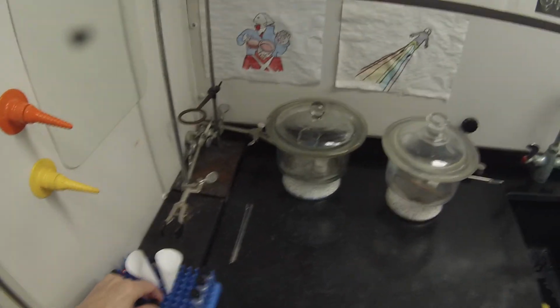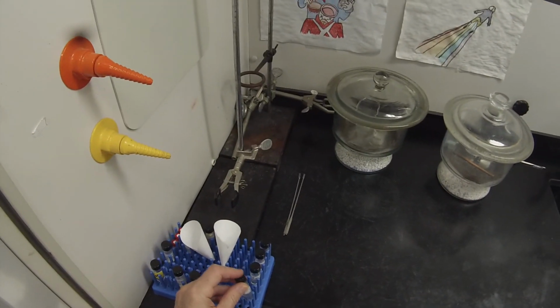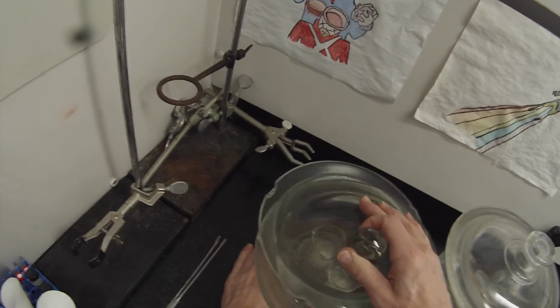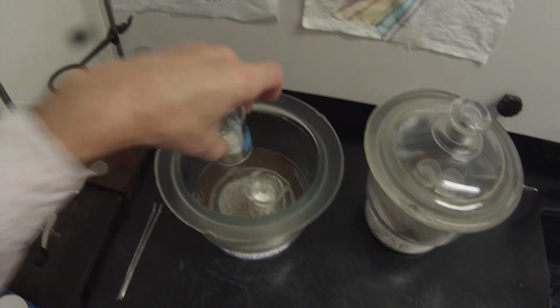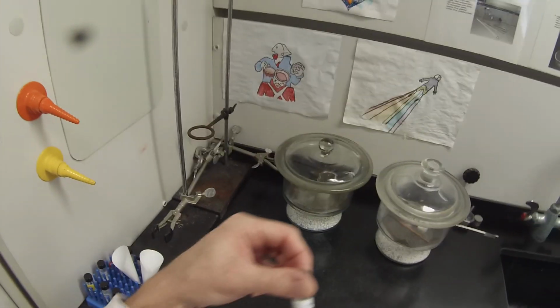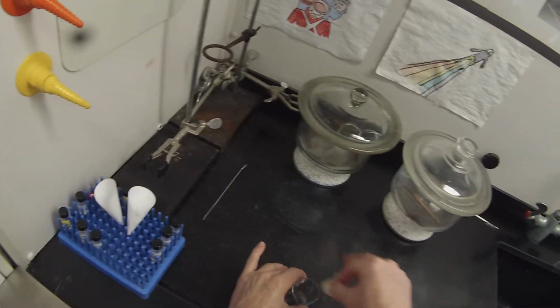So our aldol condensation product, BCL-10-66B, has been sitting in the desiccator for 3 days. It's Tuesday. I'm going to pull that guy out. And I've prepared a vial labeled with the compound name, and I've made some funnels for transfer.